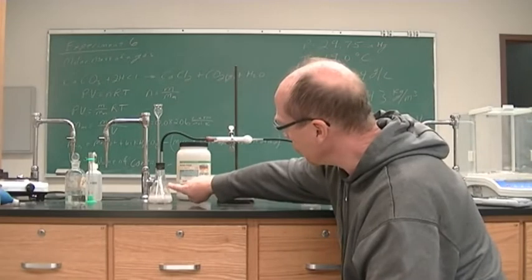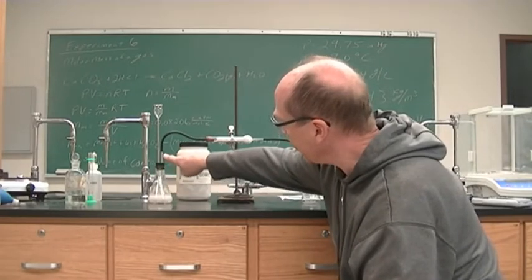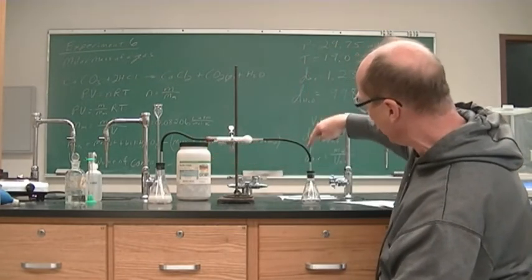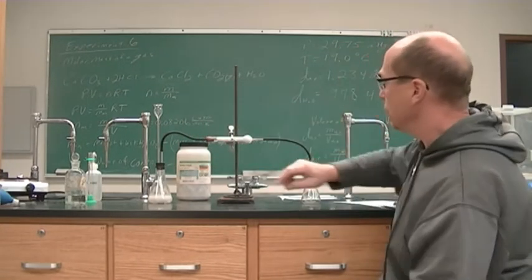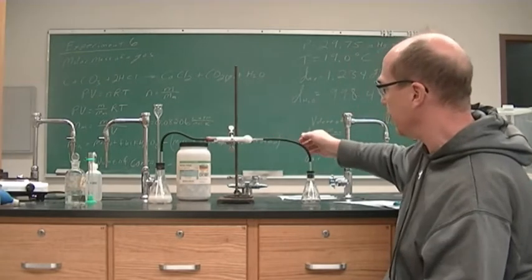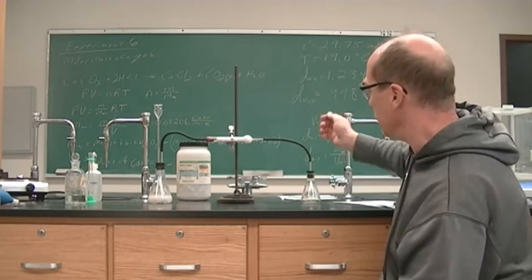Of course, the first CO2 coming through, at first this is all air, this is full of air. So the first amount of CO2 that might be coming through is still just air. It's going to take a while for that to be all CO2 at this point. It is definitely all CO2, but it is an invisible gas. You cannot see the CO2.